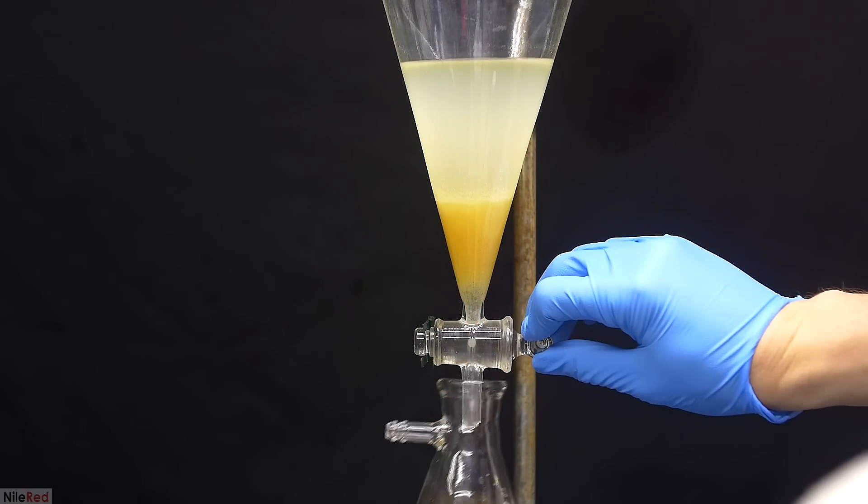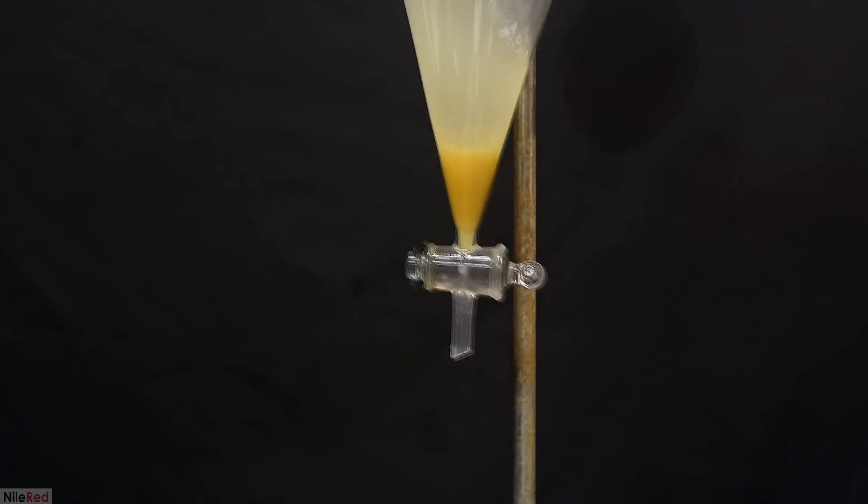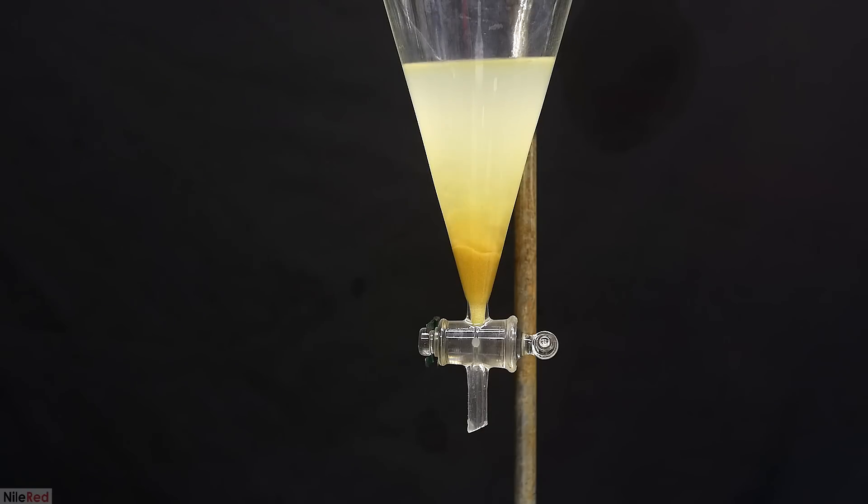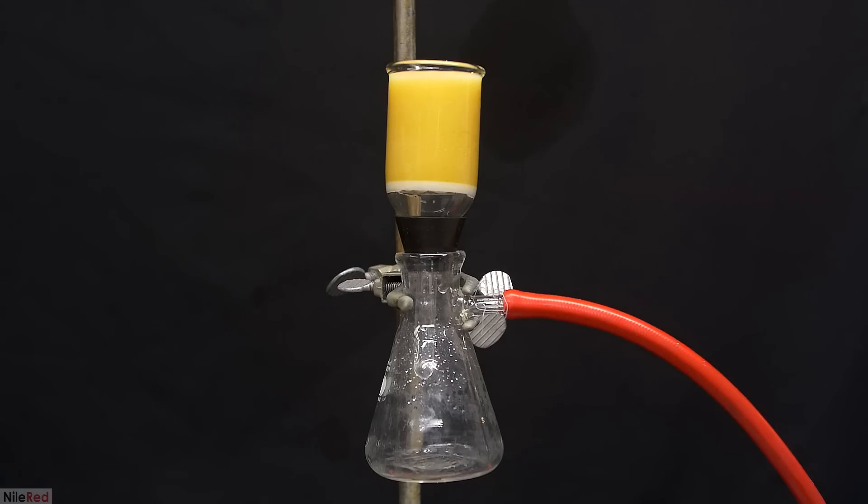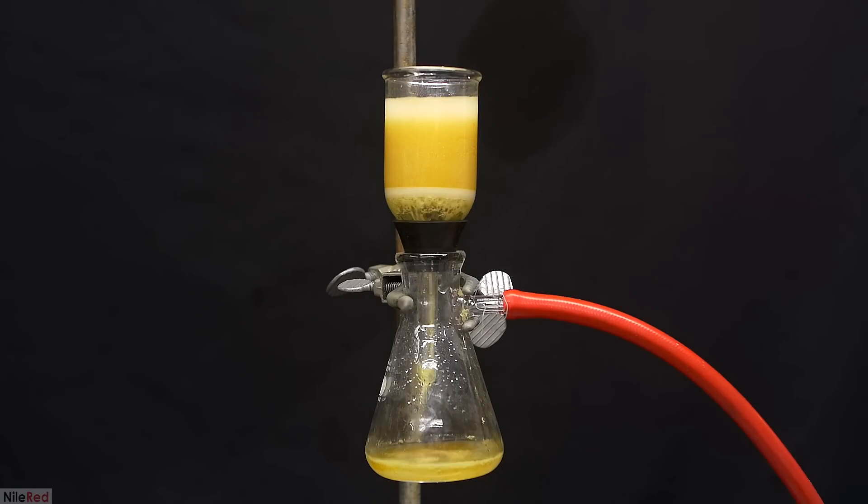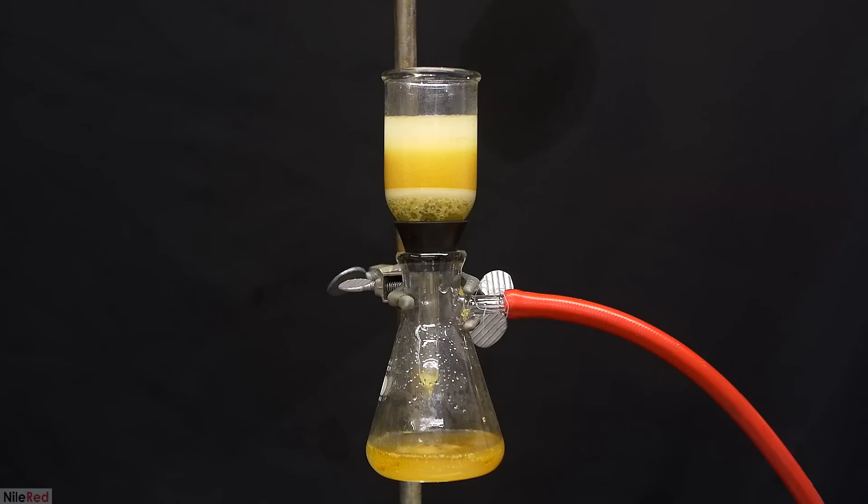So this bottom oil layer, which should contain cinnamaldehyde and benzaldehyde, is drained into a small Erlenmeyer flask. Just by looking at it, you can see that our oil is pretty murky and when we take a closer look, we can see solids floating around. Most of the solid stuff is just salt that we added earlier and it's pretty easily separated out by a vacuum filtration.